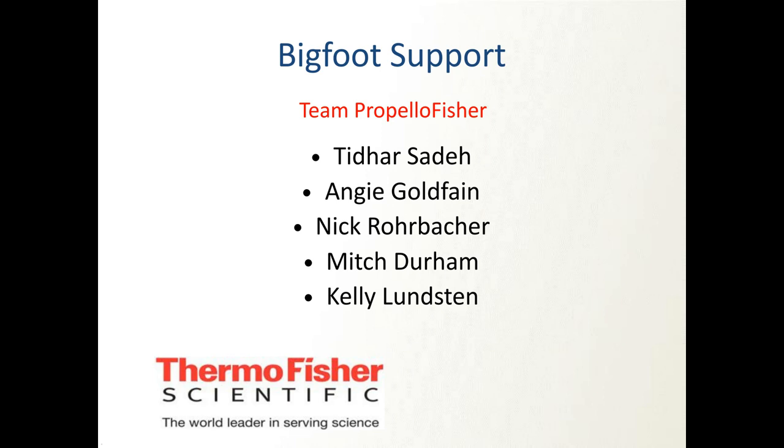So right now, in a perfect world, and we have one group that's doing it, they're trying to do everything with cellular controls. But in some recent experiments, we've done it with cellular and beads, and looked at it both ways, using the beads as the unmixing and the cellular, to see whether it affects the unmixing of the controls. And that's what I'm working on right now.